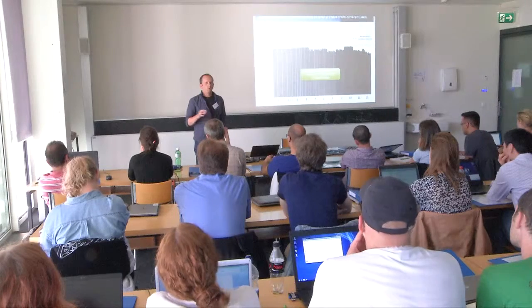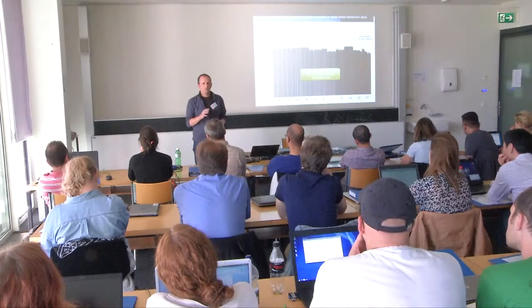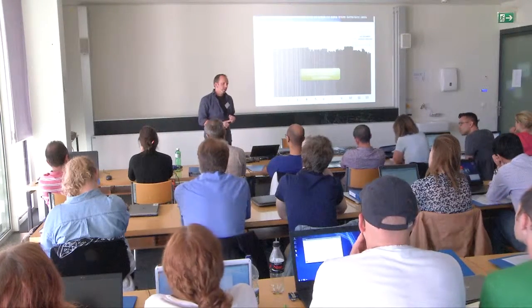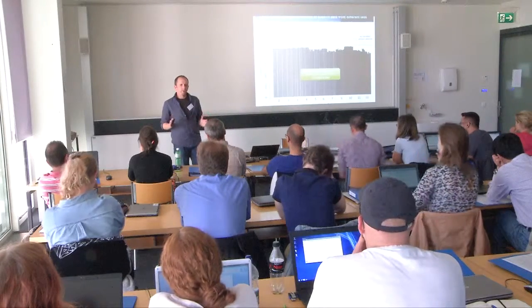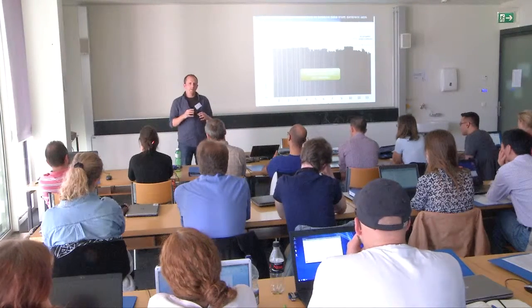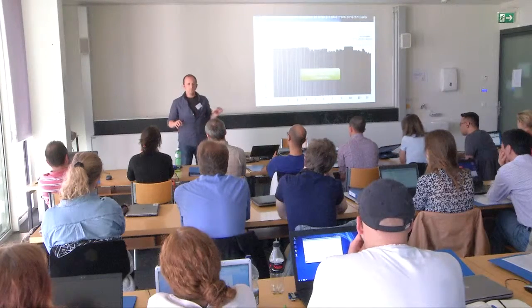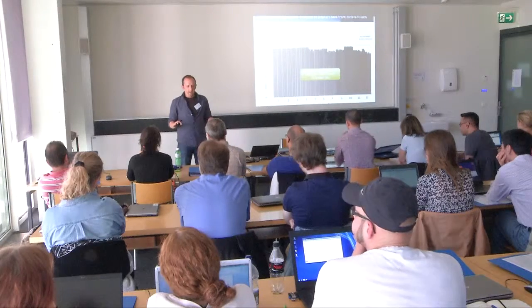We've looked a little bit more into the instrument variation and what impact this has, whether you measure the spectral library on one instrument or another. The matrix effects, my guess is, and this is a bit speculative, but imagine the case that you're going to make large-scale spectral libraries and you start to aggregate peptide spectrum matches that came from different samples, right? One came from a tissue sample, one came from a cell line or something.